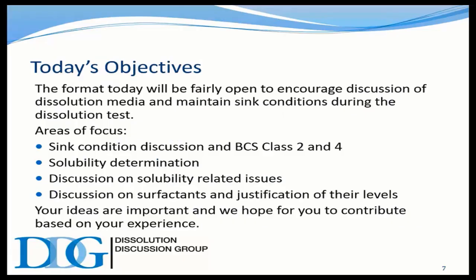So that leads us right to discussion on solubility determination. There's been a recent USP chapter introduced after years of finalizing that chapter. We'll also talk about solubility-related issues. And then, of course, to deal with that, there's a number of ways you can do things to increase solubility.